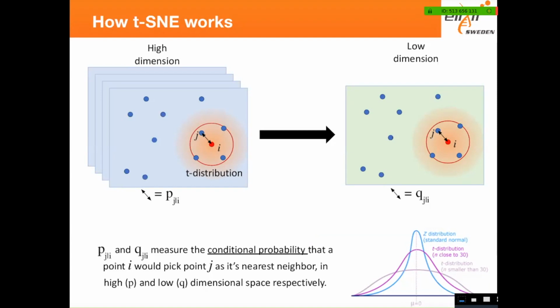That depends. By default, tSNE can use Euclidean distance just because it's easy to calculate. So it's a linear distance between this cell and the nearest ones, but not across all of them. But you can also use any other distance matrix. You can actually input the distance matrix as input for the tSNE if you need. But as default, it's usually Euclidean distance.